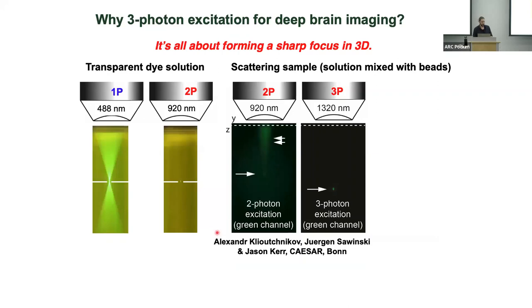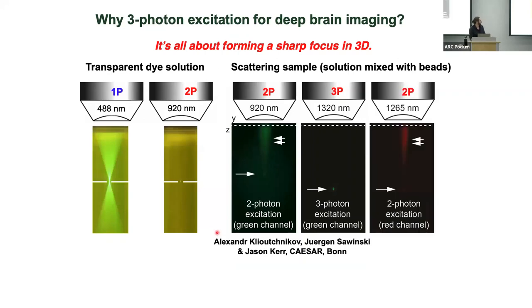I want to, again, in the interest of time, skip directly to the punchline. We've seen these images of 1-photon versus 2-photon fluorescence. The same is true of 2-photon versus 3-photon fluorescence. It sounds sort of gimmicky, and in fact, there's a very famous paper in the literature whose title includes something like photon upsmanship. But it really is beneficial. The more photons we can use for this illumination, the further into the infrared we can push our illumination, which means the deeper into the tissue we can go.